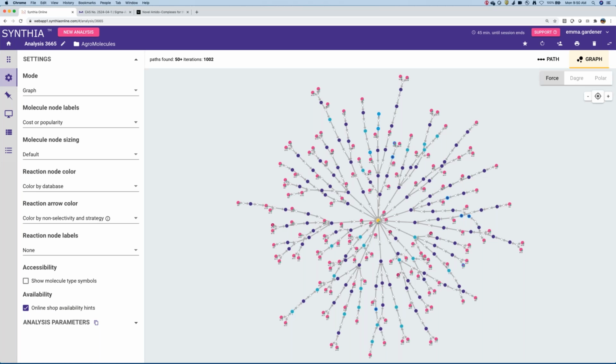But with that in mind, Emma, lots of people are asking similar things about where can we get the software from? How much does it cost? Does it run in the cloud? What sort of computer does it need? Where is a good place for them to go to find out those sorts of answers?